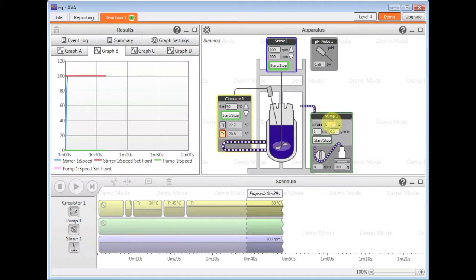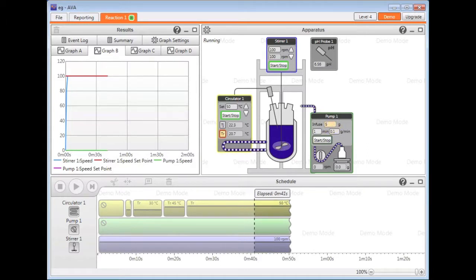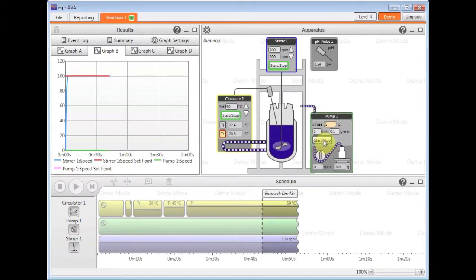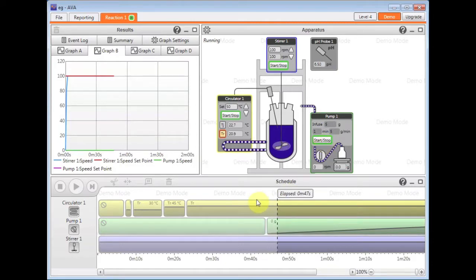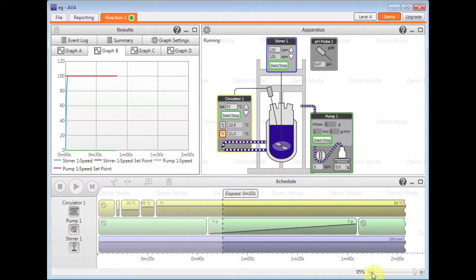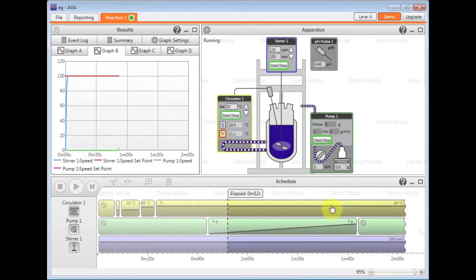So if I just add five grams in a minute here and hit the start button, AVA will automatically add a step to the schedule for me for what I've asked it to do.